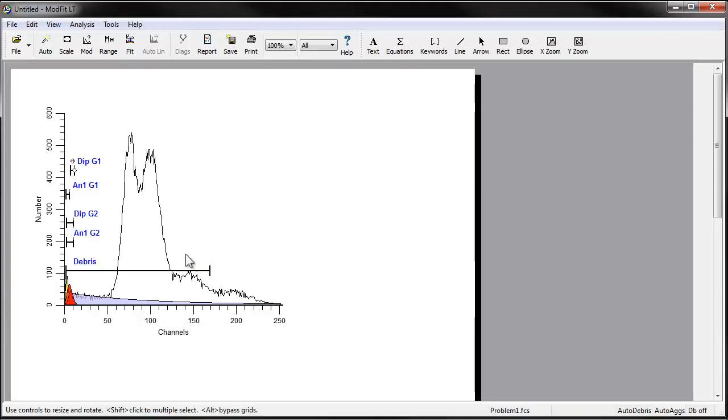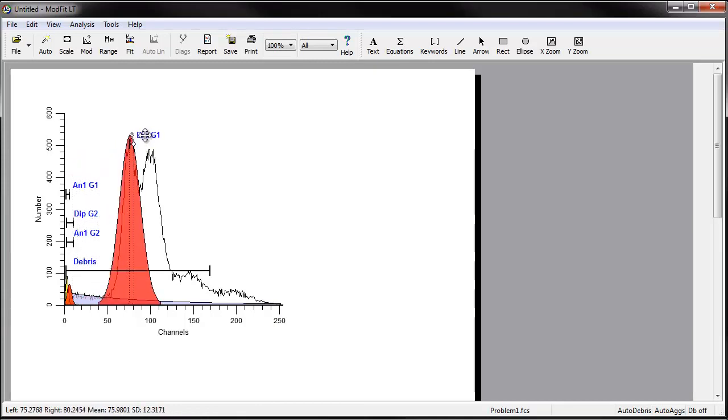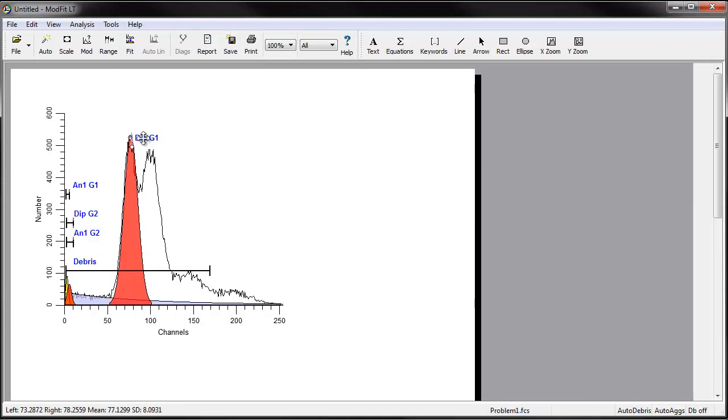Ensure that the DIP-G1 range is positioned over the first peak, the DNA diploid G0-G1. It doesn't need to be stretched to encompass the peak as long as it is centered on the peak. You should see a red fill in the first peak that indicates the range estimate of the size of the peaks.